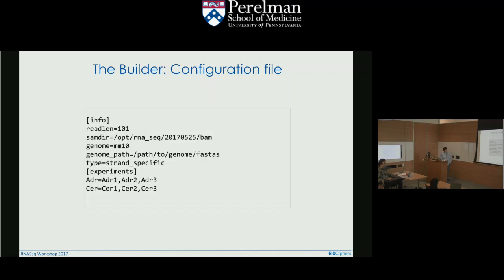And finally, or second to last, genome path. This is the path to the genome FASTA files, the sequence files. This is where we get the nucleotides for local GC content correction. So for our toy example here, that file is just going to be empty because we're not doing GC content normalization. But you do want to have a version of the genome downloaded somewhere so we could apply those filters looking for local GC content.